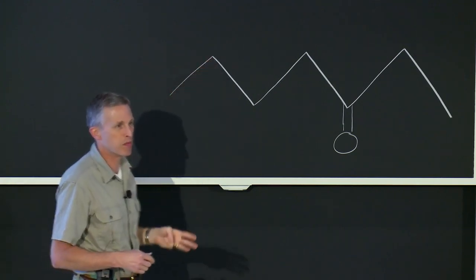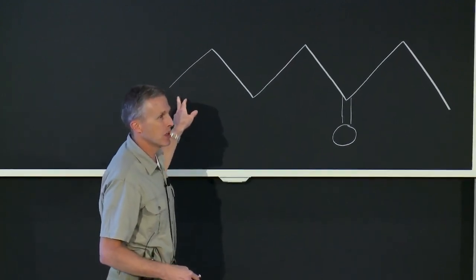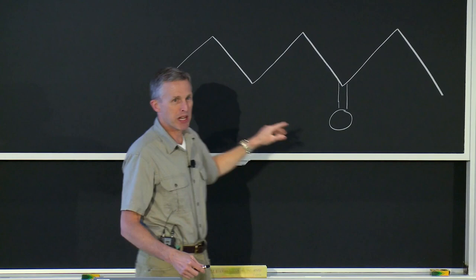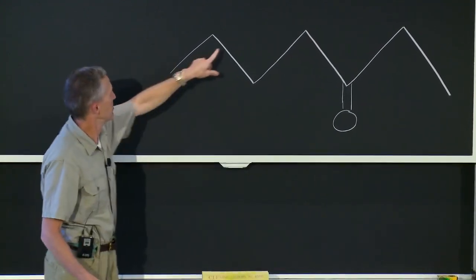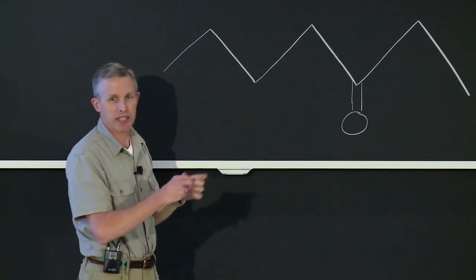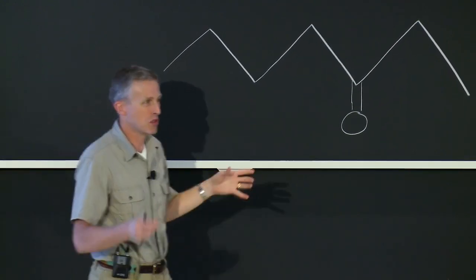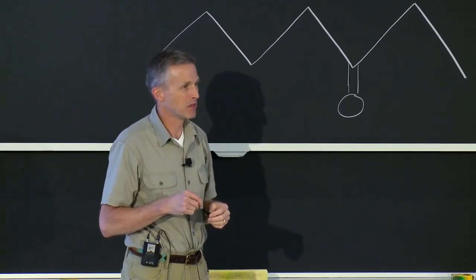So it looks through bond connectivity, and it won't necessarily give you connectivity all the way through the molecule, but you can build up, say, this chunk of the molecule and this chunk, and then you can link it together, picture linking together a chain. That allows you to put together the whole molecule.